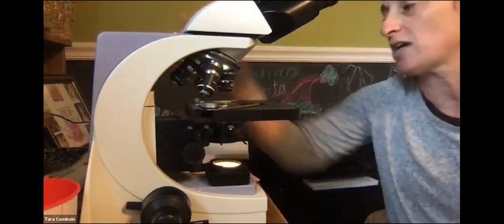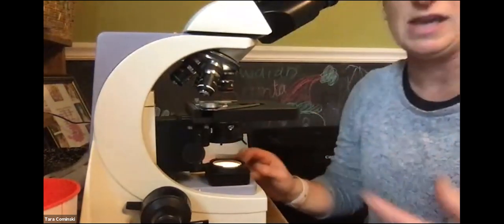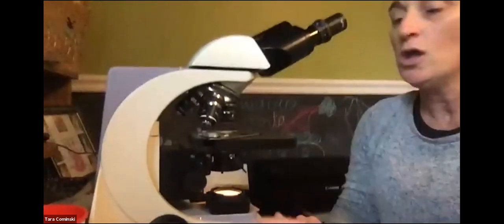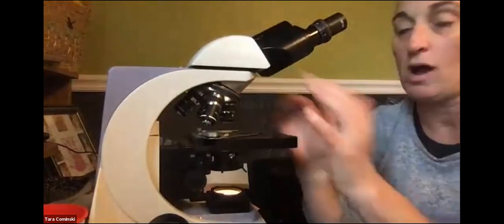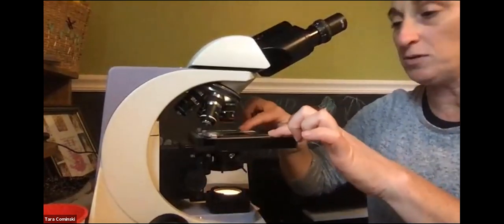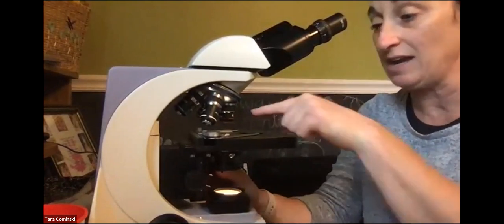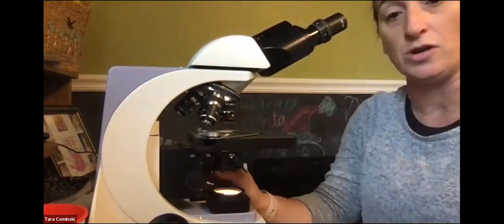All right, let me show you exactly the way that we should get something in focus in the microscope, okay? You always should start with scanning. You pull back that clip, you slide your slide in, and you can just by eye get it in the middle, where it's right under your objective.